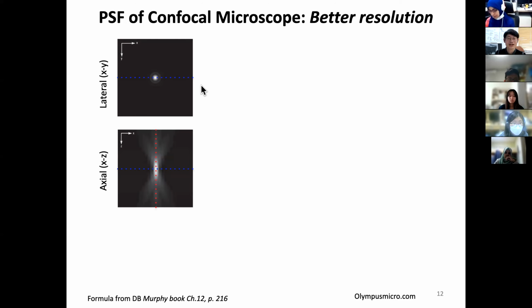In fact, this one looks like simulation data, and it's XY lateral versus axial. Think about the geometry of imaging. Fundamentally, lateral and axial are kind of different. In fact, axial resolution is usually worse. So that's what you have to remember.